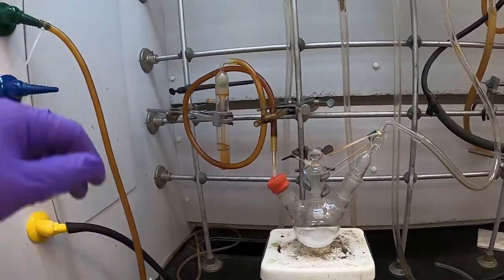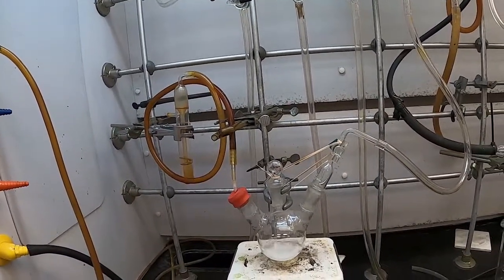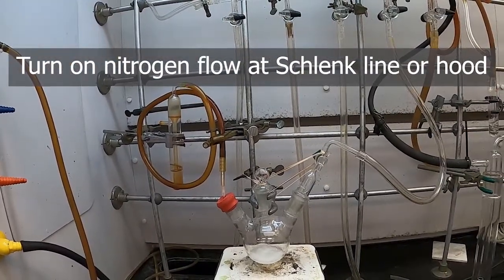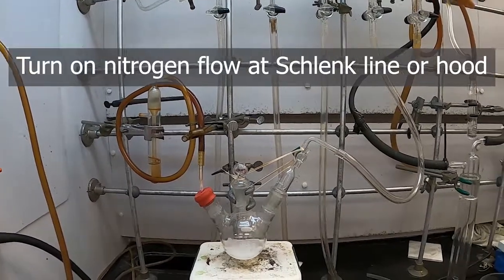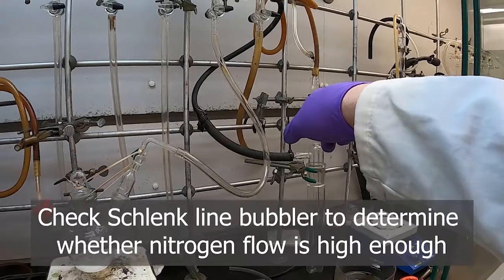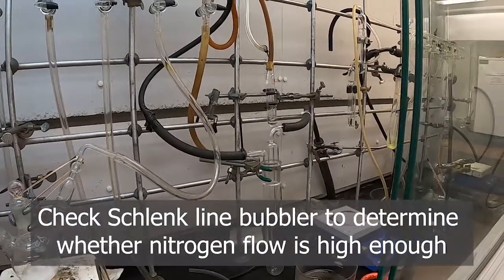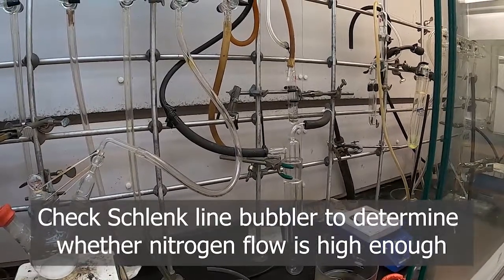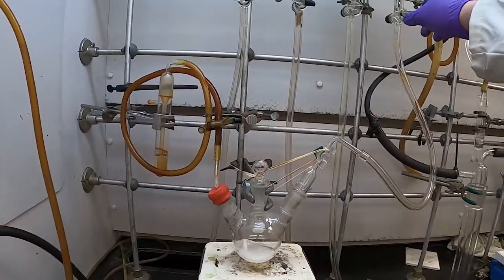So once your bubbler is in place, we can turn on our nitrogen. Up here again, the valve at the top left of your hood, or top side of your hood. You can see our flow, so we don't want it that high. So we'll watch that bubbler over there. That's the out bubbler for this line. That seems to be good right there.